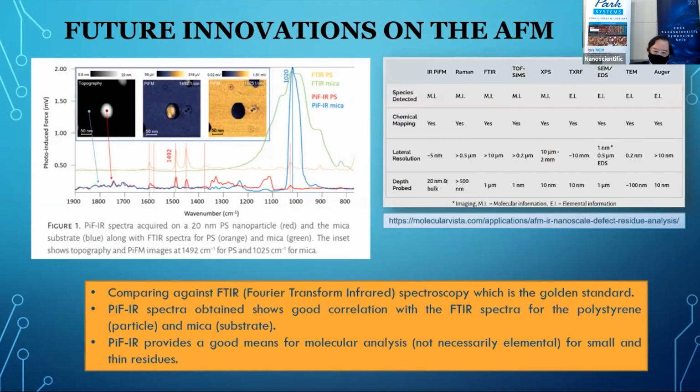So this is an example comparing FTIR versus PIFM. Notice that the peaks are very good. There is very good correlation between the two methodologies of measurement. In this particular instance, they have a polystyrene sphere on top of a mica surface, and all the peaks do line up.